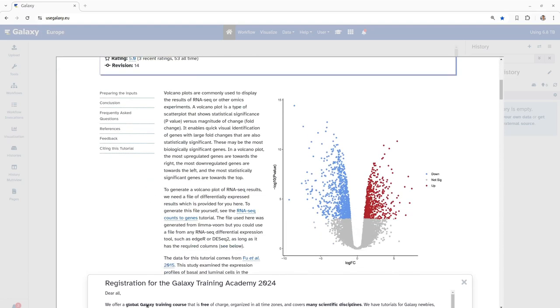Volcano plots are widely used in omics experiments such as RNA-seq to help researchers quickly identify biologically significant genes based on their expression patterns. It essentially is a specialized scatter plot which graphically represents two key metrics: the statistical significance of p-value and the magnitude of change or fold change in context of gene expression. This allows researchers to easily pinpoint the most important genes, those that exhibit both large fold changes and high statistical significance.